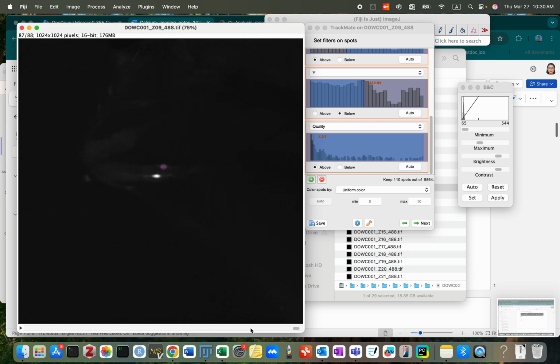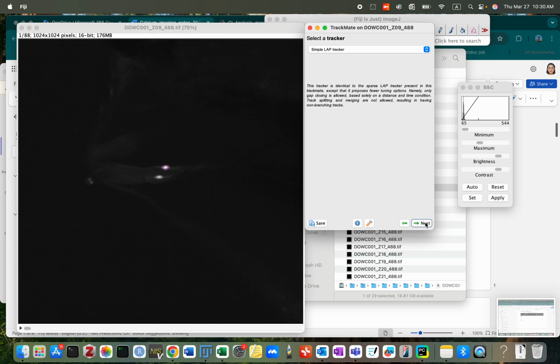So we have some wrong selections, but that's not a problem. We will delete them in Excel. Okay, so click next.